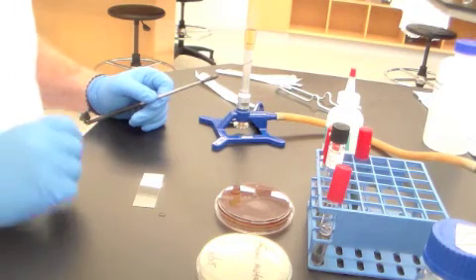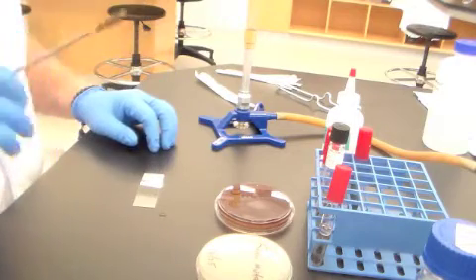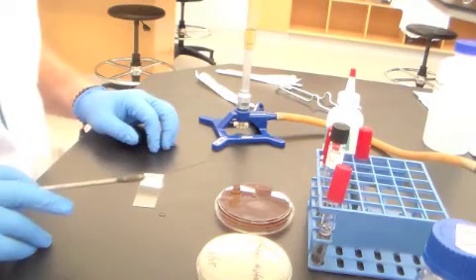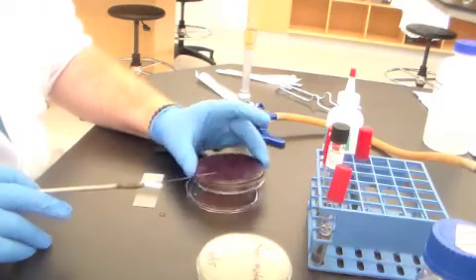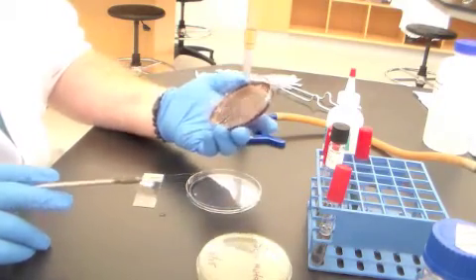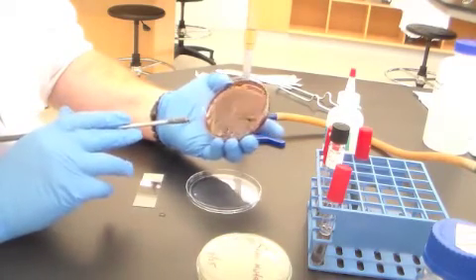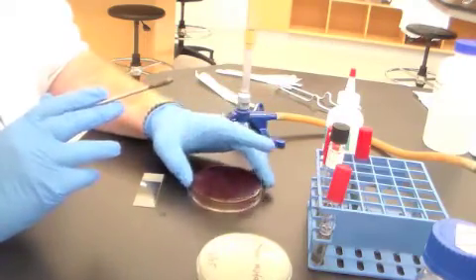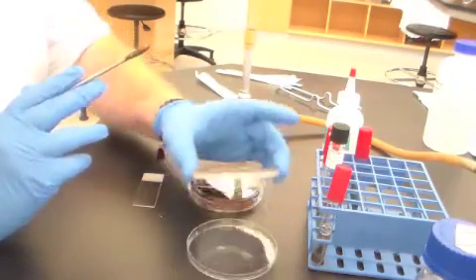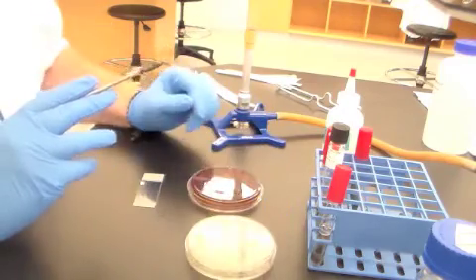Now, we're going to use this test diagnostically in the laboratory. One of the chief ways that the catalase test will benefit us is that it helps to differentiate bacteria in the family Micrococcaceae, which includes the bacterium that I have right here, which is Staphylococcus aureus, from Streptococcaceae. This is Streptococcus mutans, the bacterium that causes dental caries.